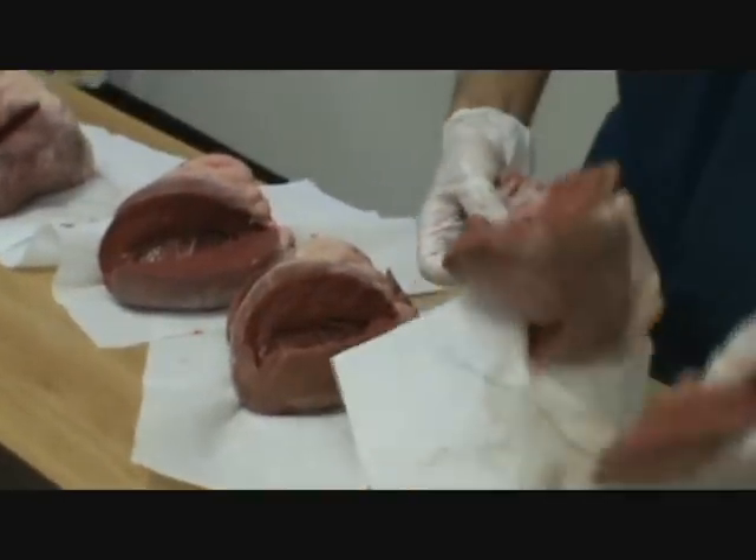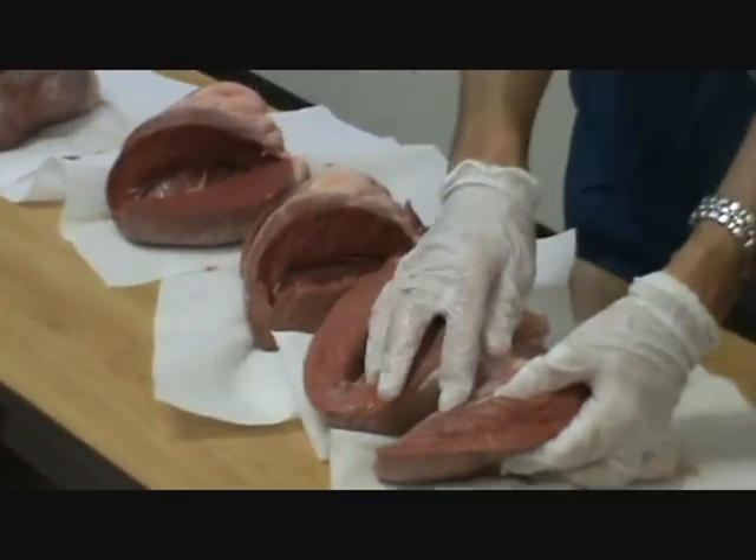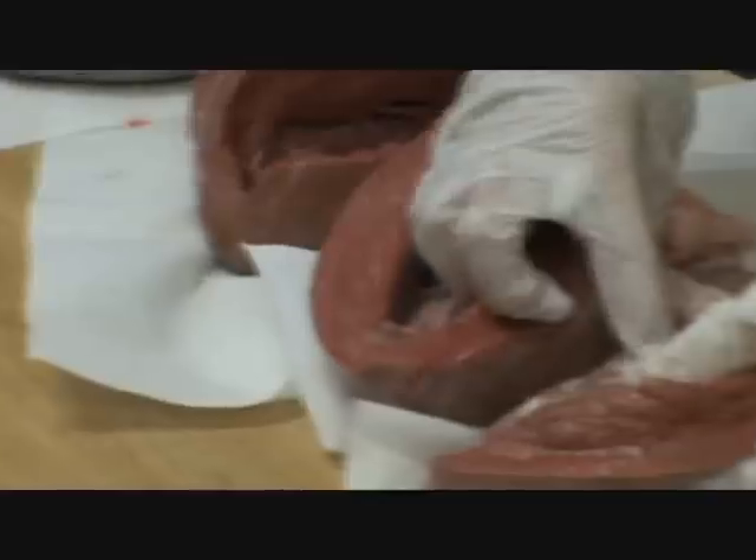Let's look at these well-dissected papillary muscles and tendons — papillary muscle, tendon, mitral valve on both sides.